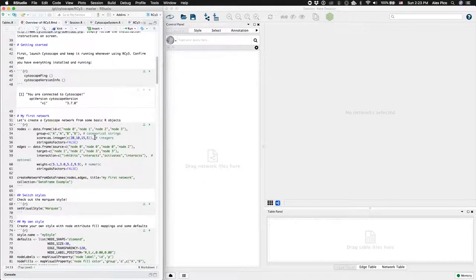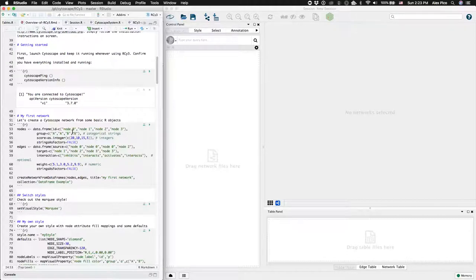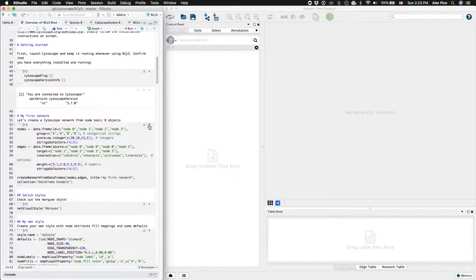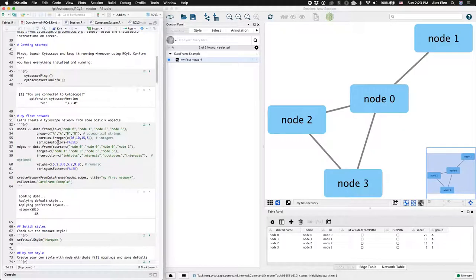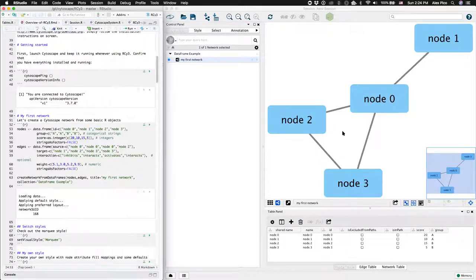The vignette then creates a network from a data frame, which is a common object type in R. The data frame specifies nodes, node attributes, edges, and edge attributes. You'll see those reflected in Cytoscape.